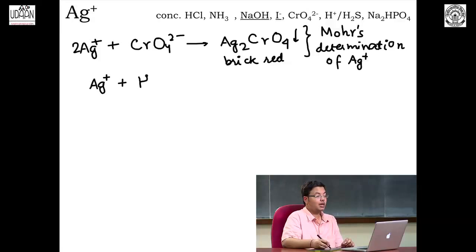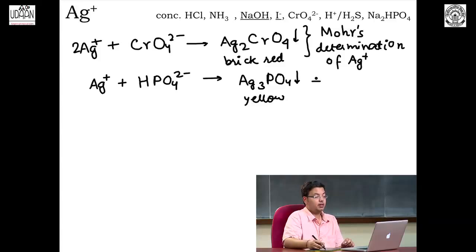इनफैक्ट इवन न्यूट्रल HPO4 2- आयंस के साथ Ag3PO4, सिल्वर फॉस्फेट का येलो प्रेसिपिटेट देता है एंड द सॉल्यूशन टर्न्स एसिडिक.